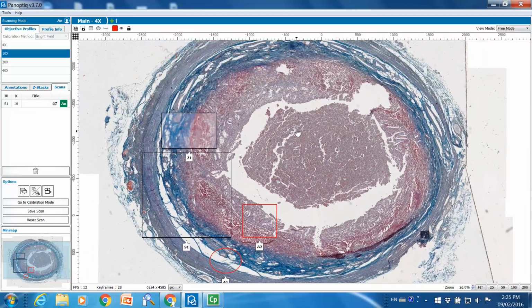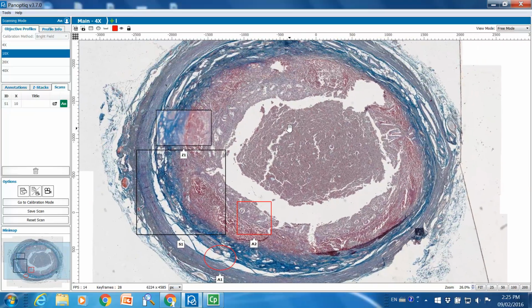So that concludes the main functions. You can do as many of these embedded elements as you like. Just be aware that file size does scale with how much you use. So naturally, the more your image, the more files, the bigger the file size is going to be.